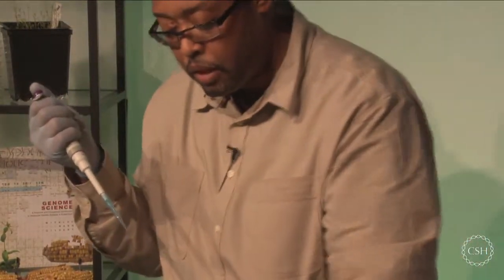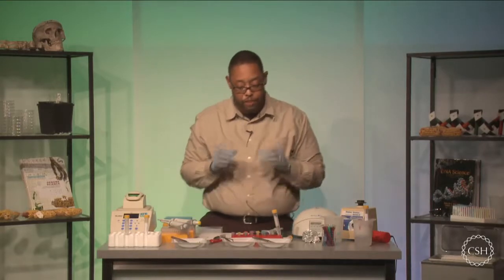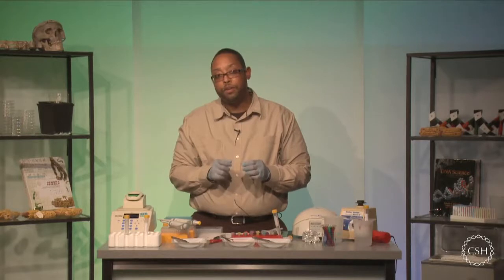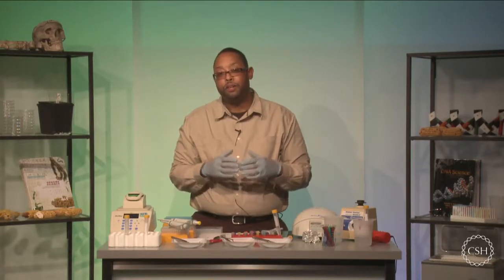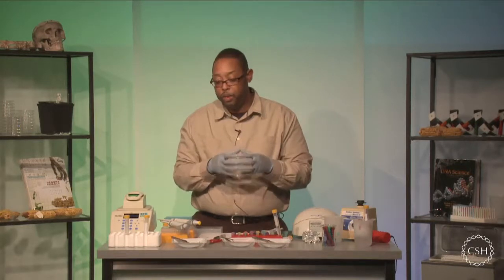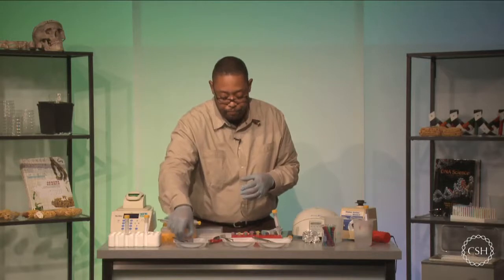Okay. Now, once you have each sample physically submerged, we're actually going to use the pestles now to physically crush each sample. It's important that you give a really thorough round of crushing so that you can get the maximum amount of release of the DNA in there, or at least that we're destroying most of the cell membrane so that we can extract the DNA, because we are going to do an incubation on top of the crushing.